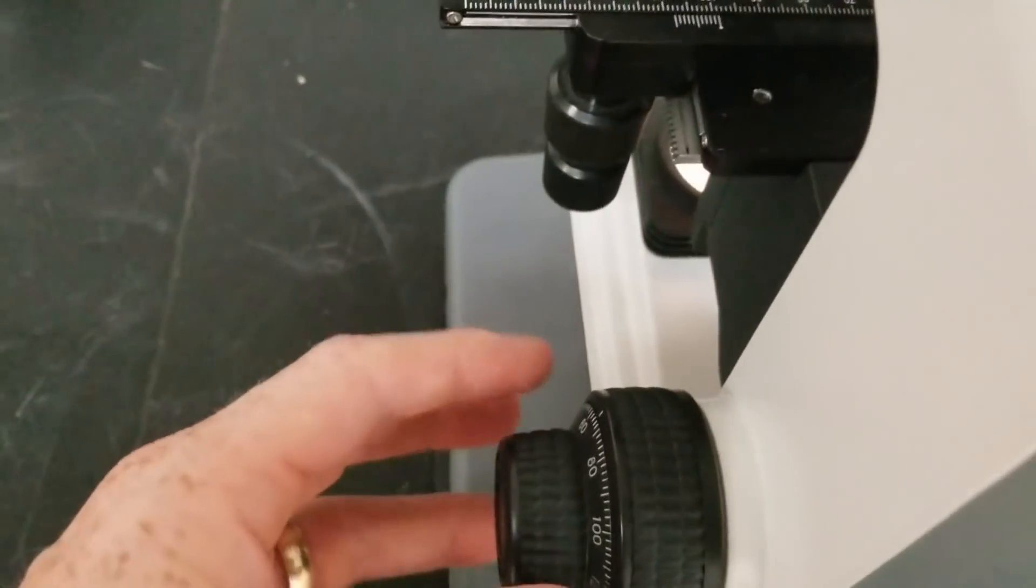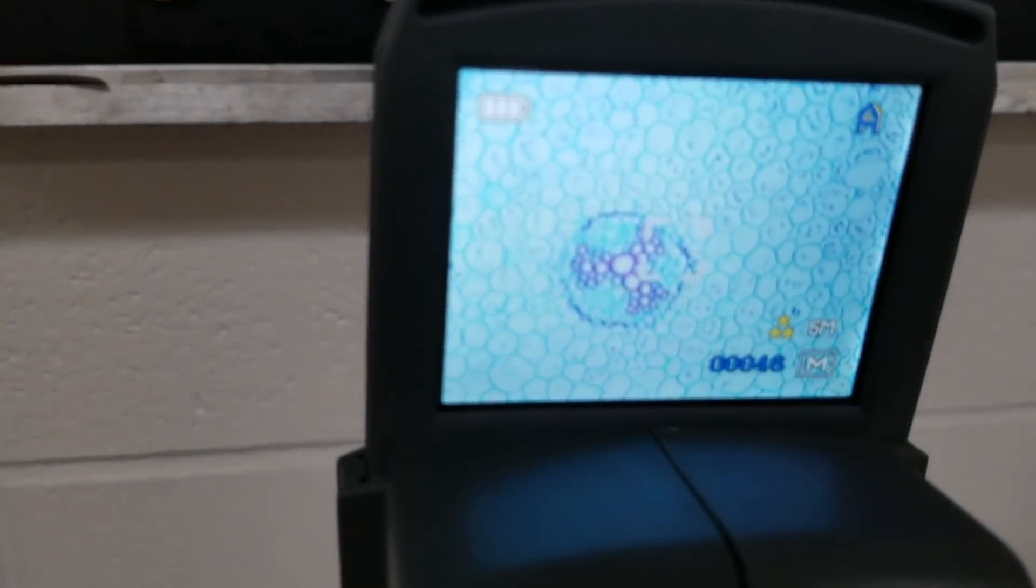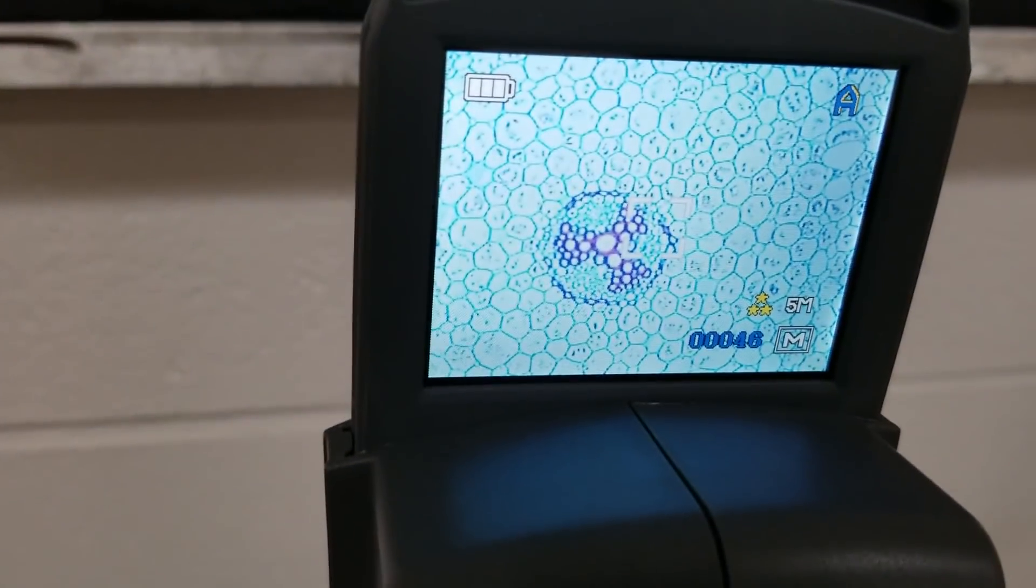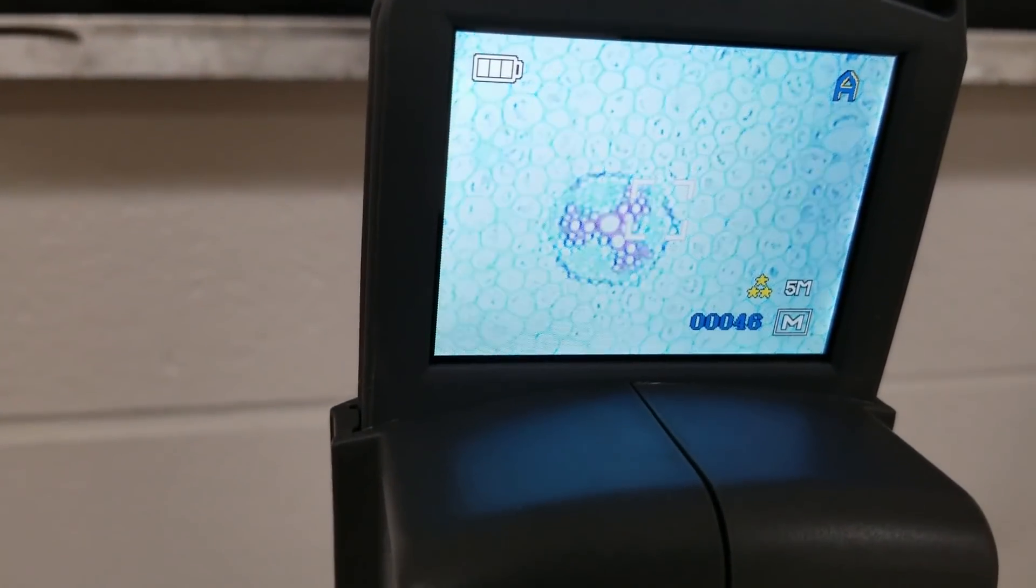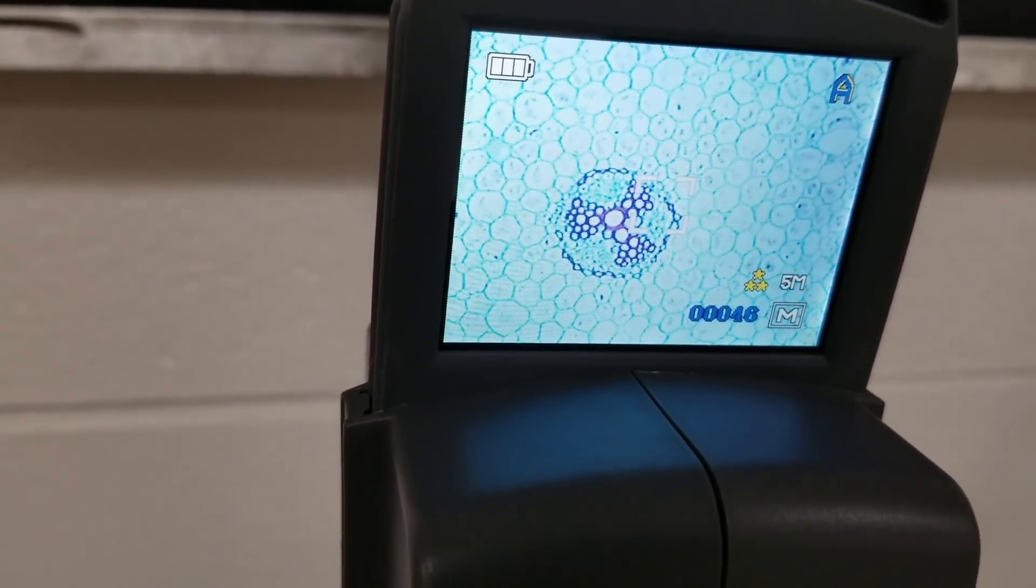Go back a little bit. And then move the fine adjustment knob until it becomes as crisp as I think I can possibly get it, which is actually pretty good right there.